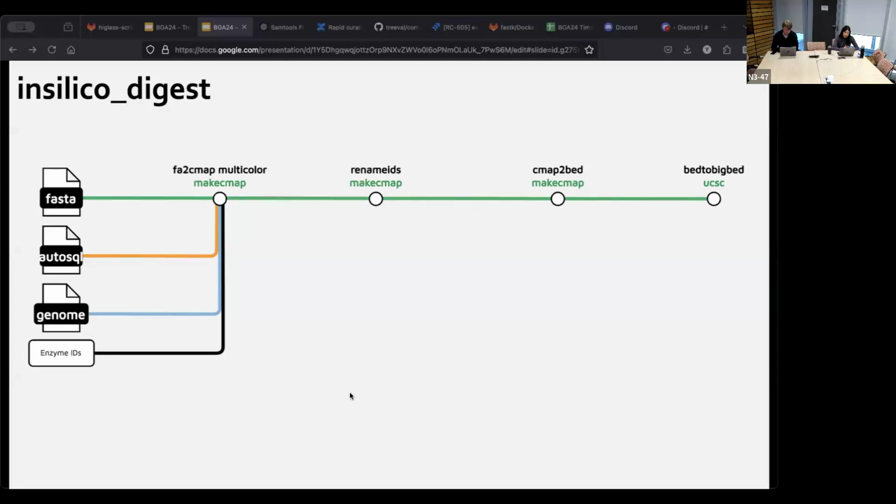But Bionano data, we're not really using in the Tree of Life project now. Even with the absence of Bionano data, we still run the in silico digest workflow regularly. Typically, we use three different enzymes at once, allowing us to observe the distribution of cutting sites across the genomes. These three cutting enzymes are DLE1, BssSI and BspQI, and I think most of you are very familiar with Bionano cutting enzymes.